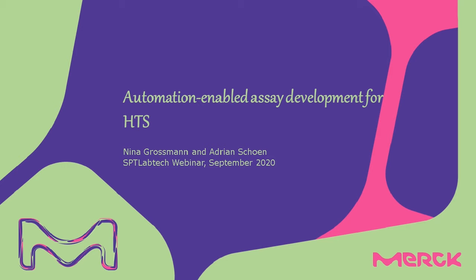Yeah, thank you, Carrie, for this kind introduction. Hello, everyone. I'm sitting here in Darmstadt, Germany, together with Adrian, and we will give you some insights into how we are developing assays for high-throughput screening, and we want to give a more detailed introduction into how we are using benchtop automation for assay development. In this case, we will introduce how we use the Dragonfly Discovery from SPT Labtech.